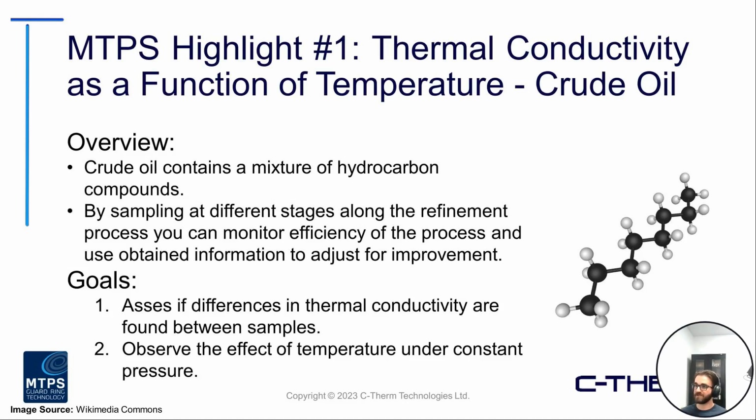So looking at our first MTPS case highlight, this is thermal conductivity measurements as a function of temperature on a crude oil sample. I mentioned the oil and gas industry, linked to these petroleum geology applications. Extraction of these crude oils is something that we've supported many groups with. These crude oils contain a mixture of hydrocarbons.